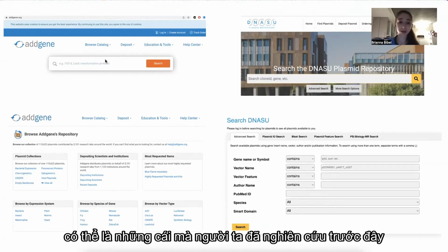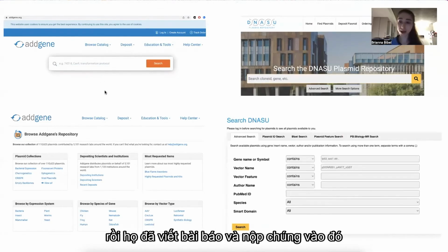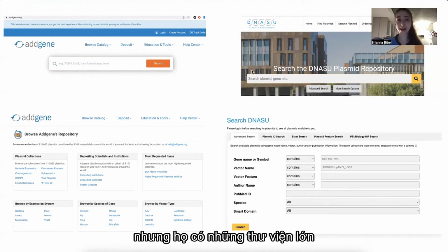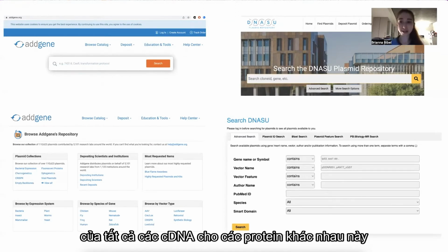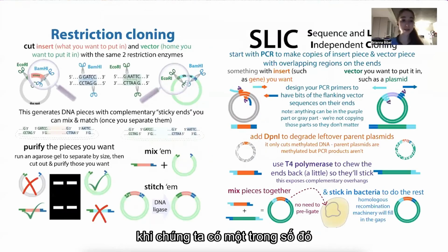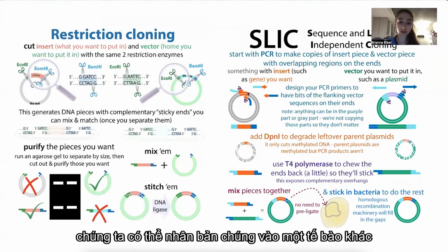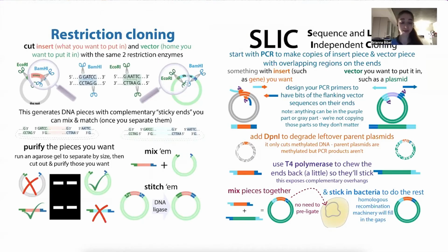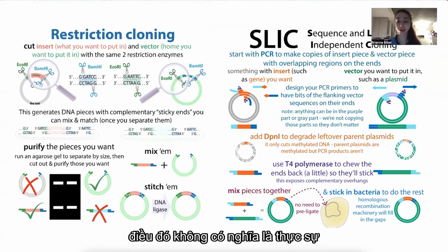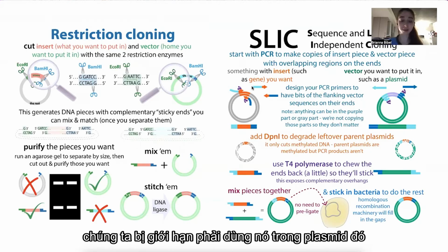So either ones that people have studied before and then they've done papers on them and deposited them, or you can find ones that no one's really studied that much, but they have these giant libraries of all the cDNAs for these different proteins. And so we'll look at more of that later. Once we have one of those, we can then clone them into a different cell that we would like better. So even if we get a cDNA that comes in one plasmid, that doesn't mean that we're restricted to using it in that plasmid.